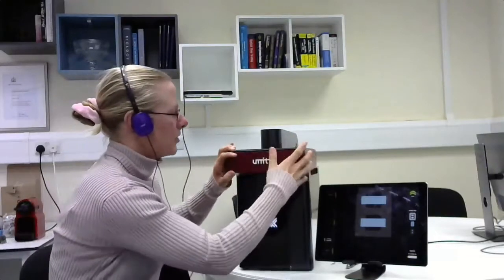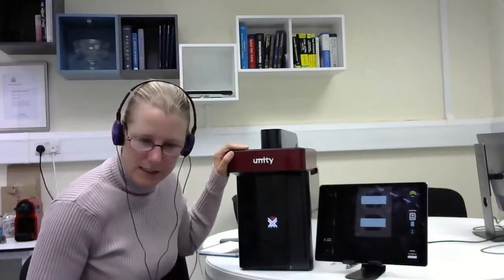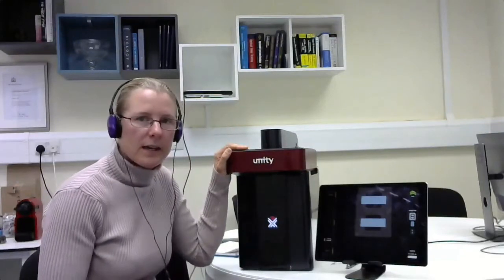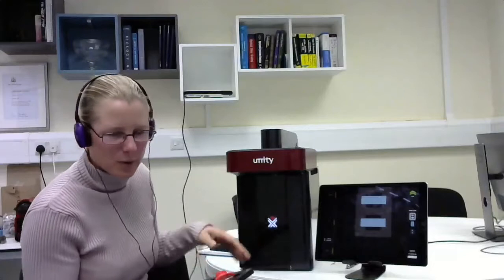Unity is an all-in-one benchtop confocal. Everything is inside here, including the computer, the light source, the camera, the screener, and so on. There's nothing hidden underneath the table, no big box. Some of you may have seen the nano-imager from ONI - it's a tiny instrument but has a big light source attached to it. There are no hidden boxes attached to this system at all.